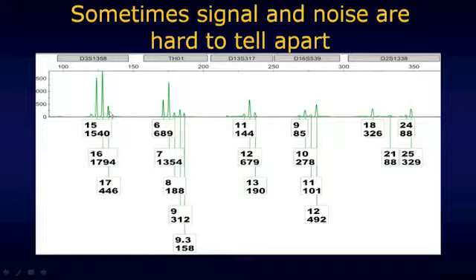Again, just to be consistent with things that we've been talking about in other videos here, this is a clear indication that we're talking about a mixed sample. If that 17 is real, and we could probably say that it is signal rather than noise, then we're talking here about a sample that's a mixture of at least two people, just based on what we're seeing at this one locus, because one person shouldn't be contributing more than two alleles to any given locus. So we see a third peak.